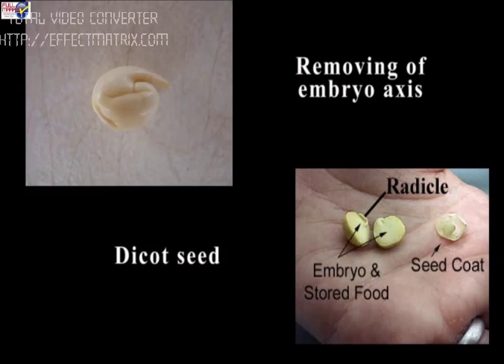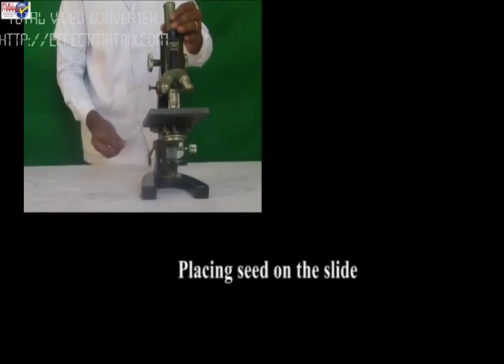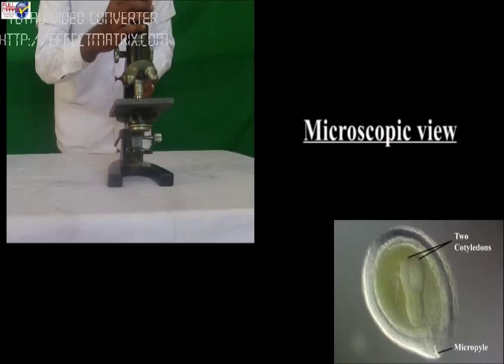Now slowly remove the embryo axis with a needle and place it on the slide. Observe these three parts of the seed obtained, record your observations and draw diagrams.